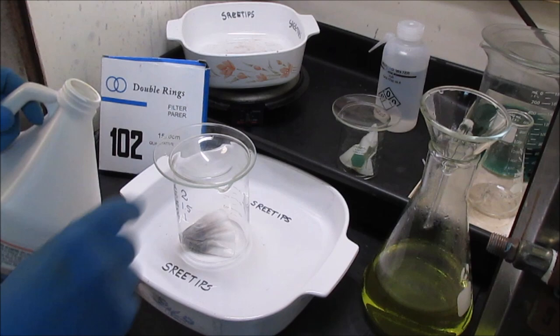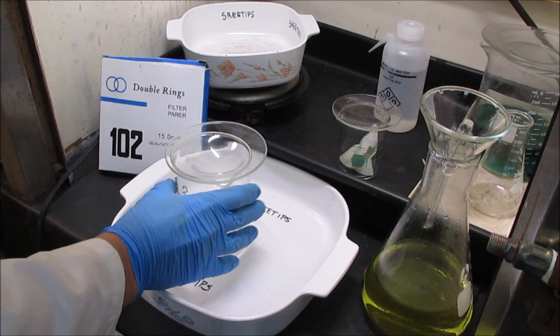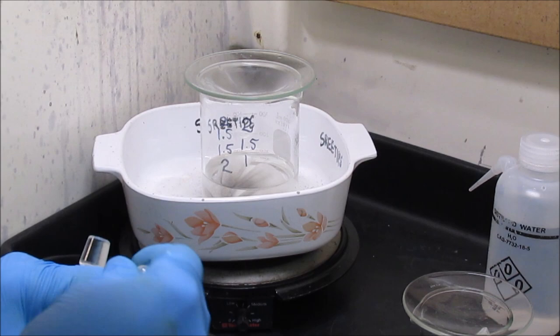Now I'm going to fill the beaker up to the 200 ml level with hydrochloric acid. Put it over here on the heat, turn it on medium. I wrote down all the additions of nitric from the first time we did this. It's 11.5 ml, so it should take about that much this time around.